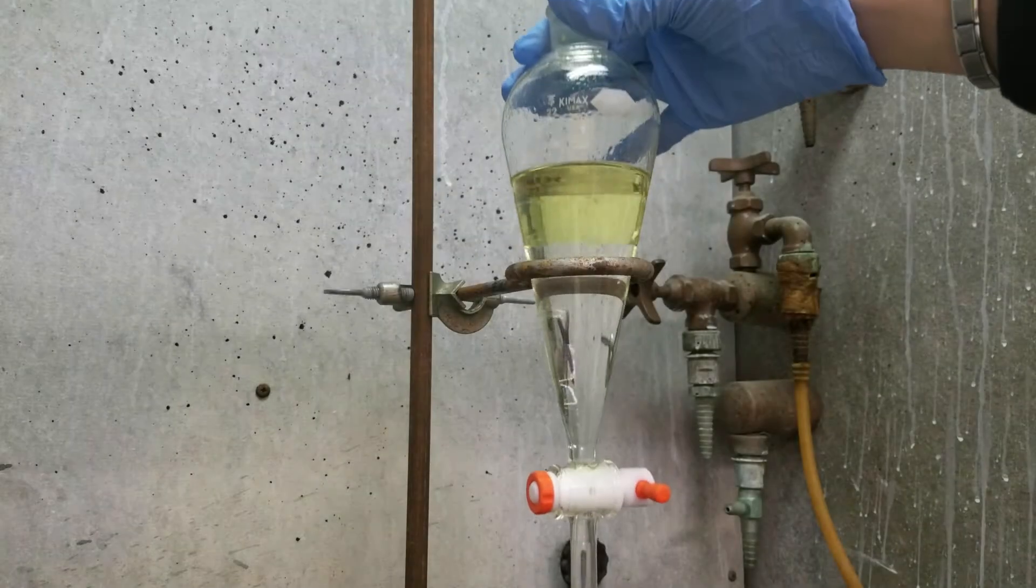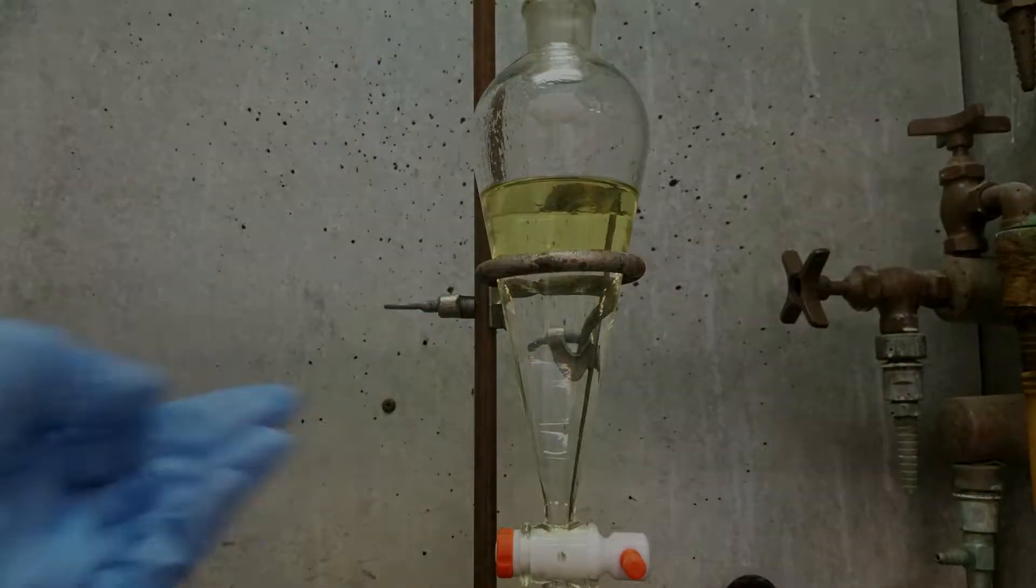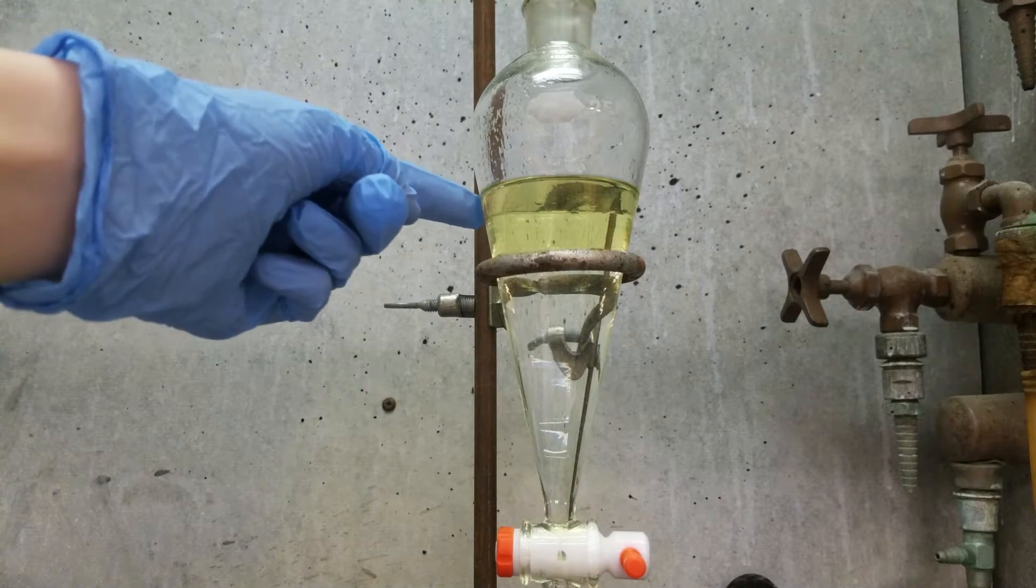Place the separatory funnel back onto the ringstand and wait for the two layers to form. In this case, the denser solvent is on the bottom while the less dense solvent is on the top.